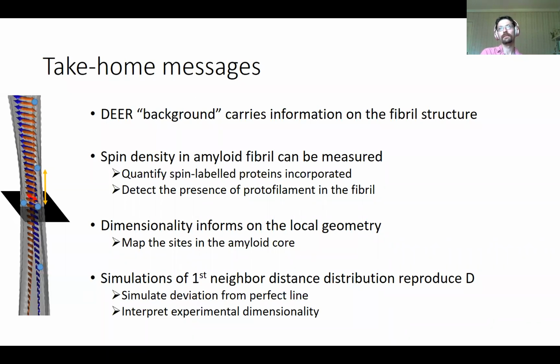Yeah, you might see it, but let's say maybe the deviation is not so big, so that within the noise you can't see it. But in that case, we've still changed concentration, and you see D is consistent. When you change the dilution factor, the fact that alpha is proportional is also a good indication. And maybe the ultimate proof is that with biochemistry, you can make sure that you no longer have a significant amount of spin in solution. Maybe I should have started with that, actually. We have about 95% of our protein included inside those fibers.